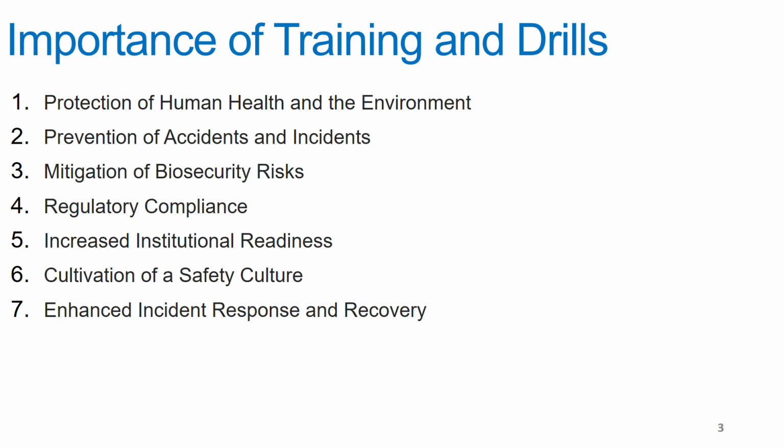If you conduct regular trainings and periodic drills, you ensure that people are well informed of the risks they pose while working in the laboratory, and aware of the biological agents they are handling and the different types of hazards. If people are aware, they will take extra precautions and be safety conscious, and therefore there will be protection for themselves, the public, as well as the environment.